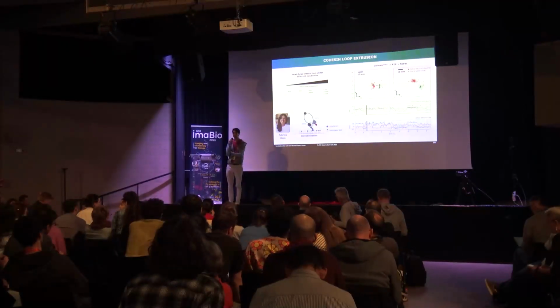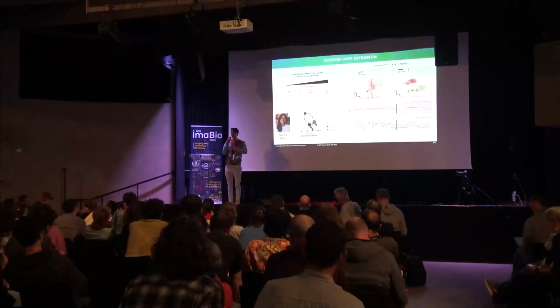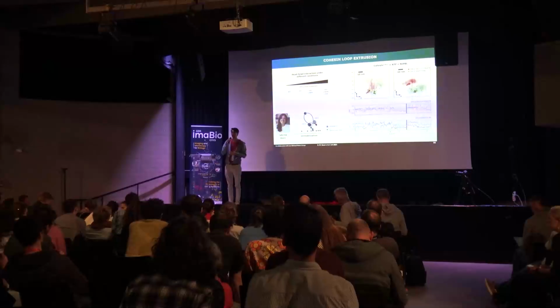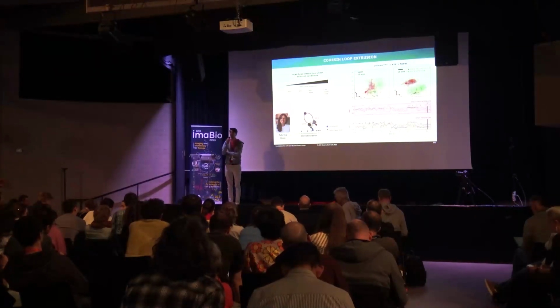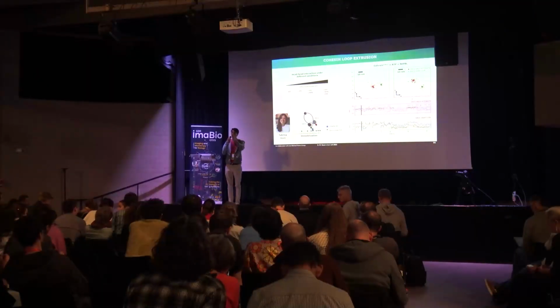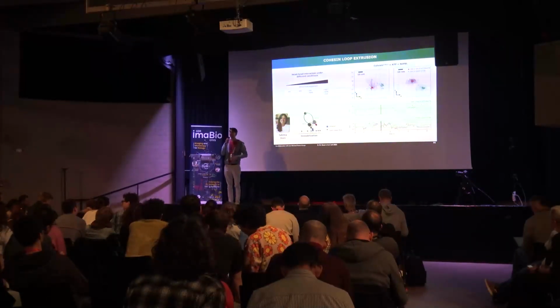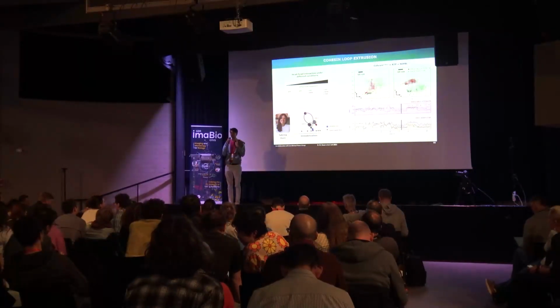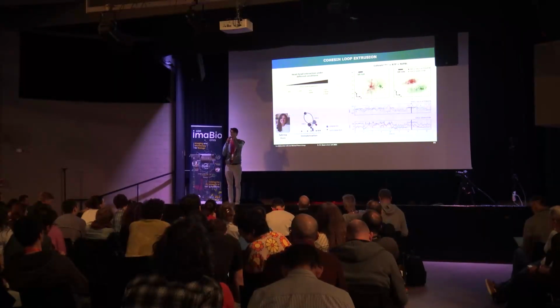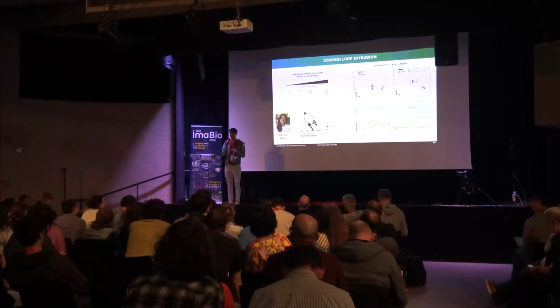So as you might well know, the polarization of the beam at different locations is very different. That is especially true for the top hat beam. The top hat beam in the lobes, in the axial lobes, is X polarized, and on the lateral lobes is Z polarized. So if you have a fluorophore or a dipole that is static and you do MINFLUX with this beam, you're going to be probing it in a bit of a weird way.